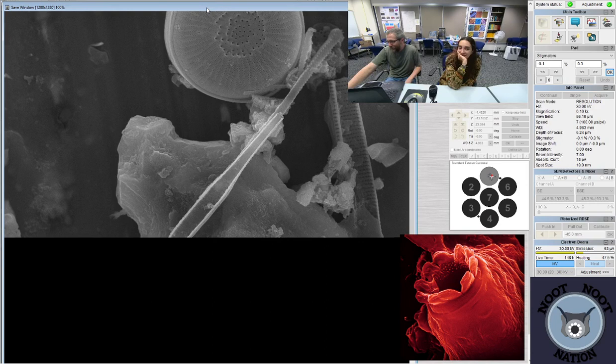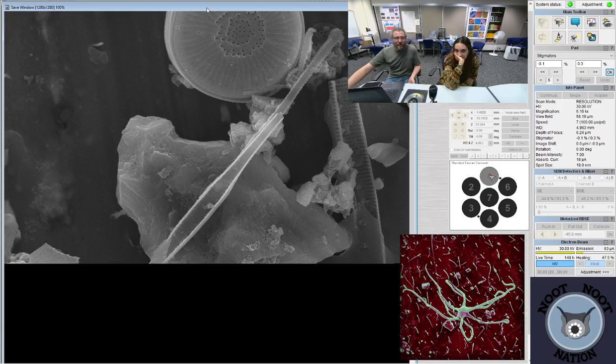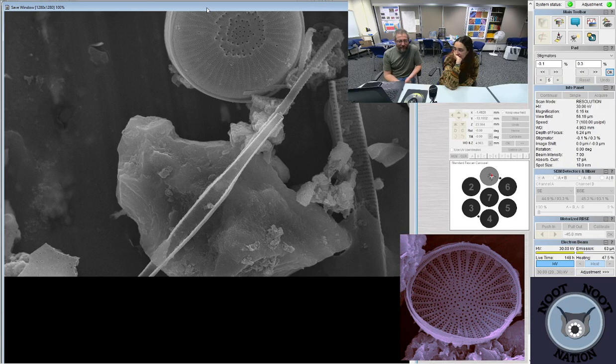It's essential, yeah. Why nitrogen? So nitrogen is what makes up most of our atmosphere today. 80% of it is nitrogen, which is inert.